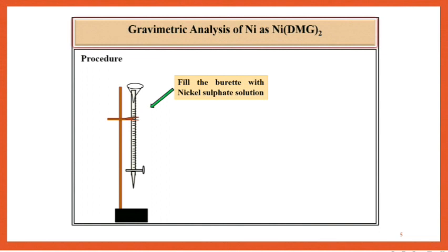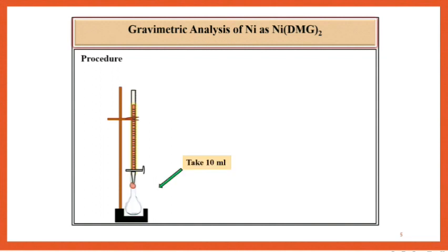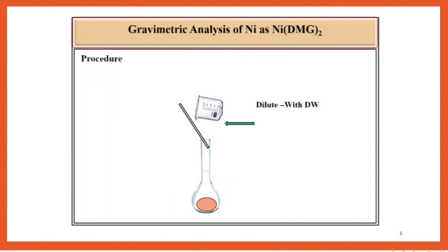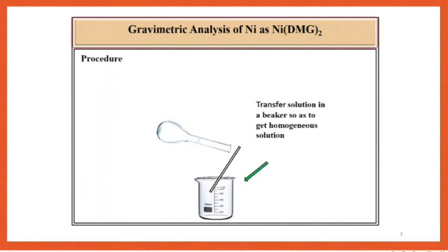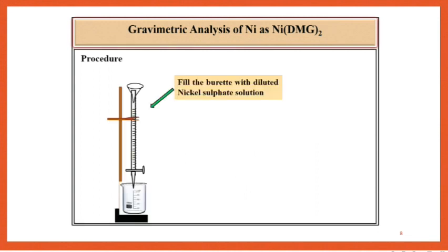Procedure: Fill the burette with nickel sulfate solution, and from this burette take 10 ml of nickel sulfate solution directly in a 100 ml volumetric flask. Then dilute this solution by using distilled water and make up the volume up to 100 ml. Thereafter pour this diluted solution in a 100 ml beaker so as to get a homogeneous solution. Then fill the burette with the diluted solution of nickel sulfate.